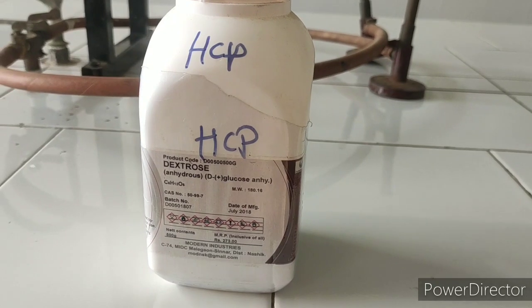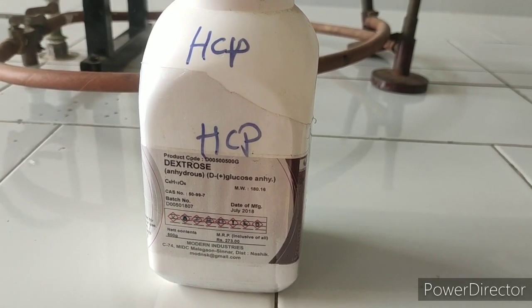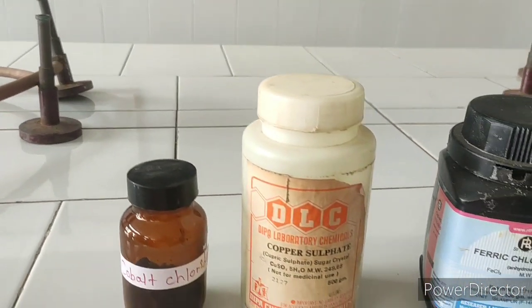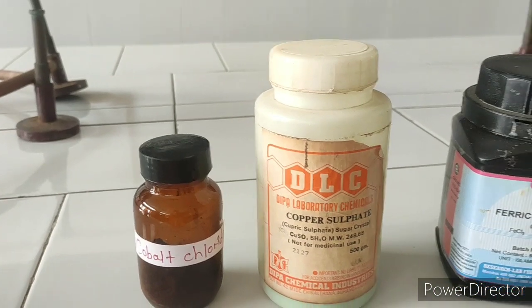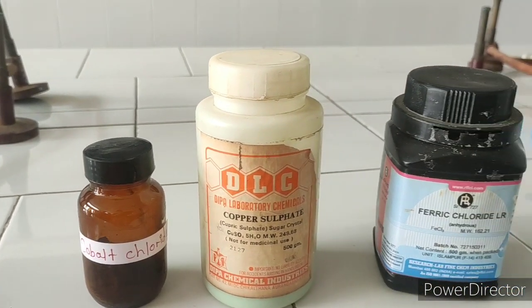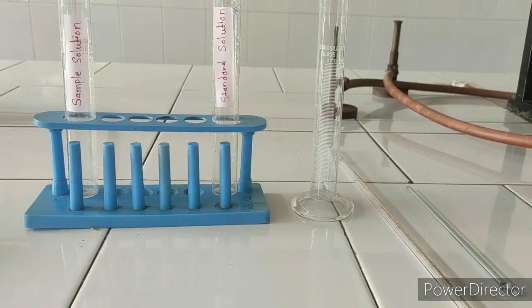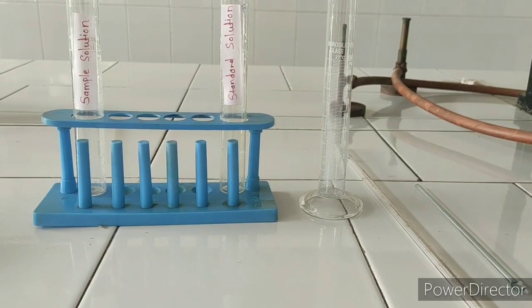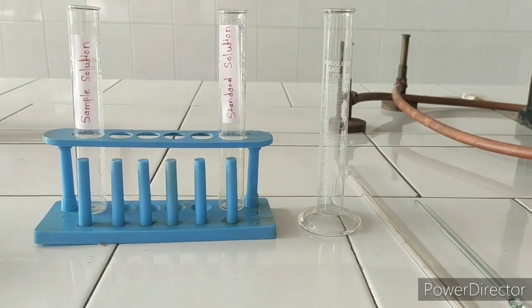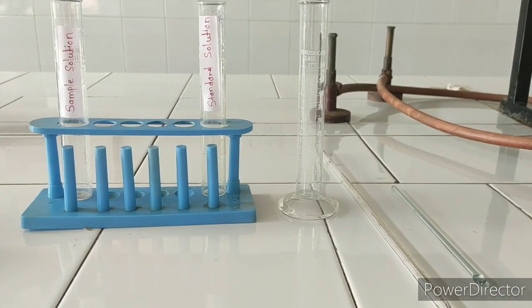Chemical required for sample solution: dextrose anhydrous IP. Chemical required for standard solution: cobalt chloride, copper sulfate, and ferric chloride. Glassware required for the experiment are a pair of Nestler cylinders, one measuring cylinder, pipette, and stirrer.